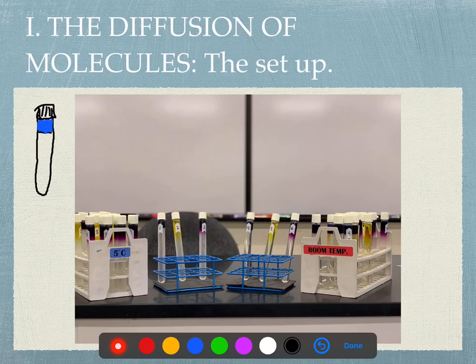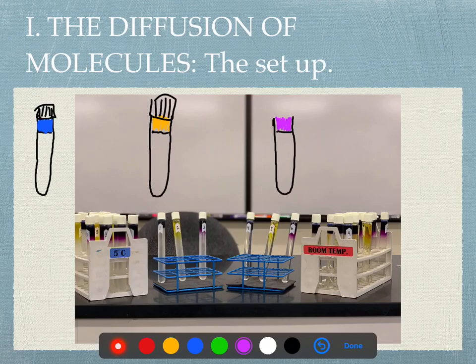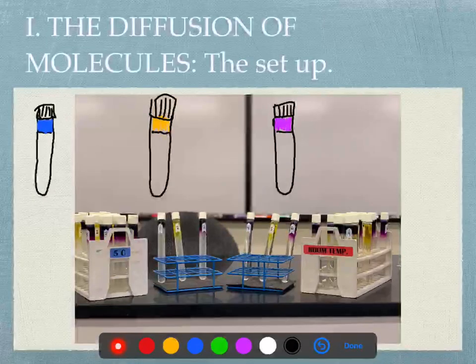They repeated the same sort of setup for a second tube, also filled with jello, but this time filled with a different color dye, and again, also capped so it wouldn't leak out. And finally, a third tube was created, also with a jello, and filled with a liquid dye, but this was a third different dye, and that tube was also capped.